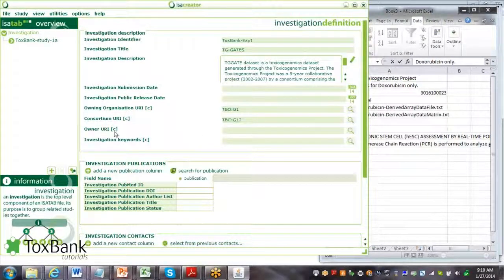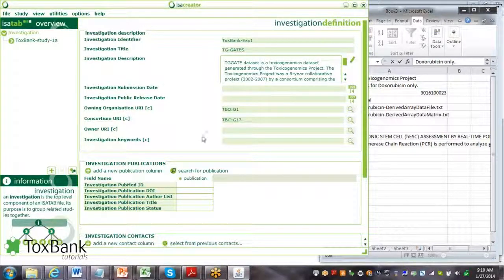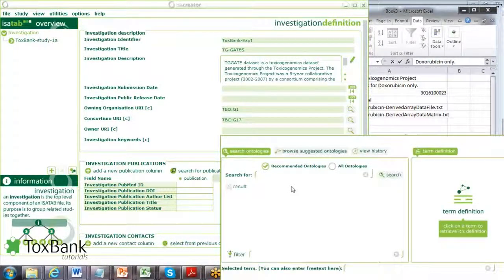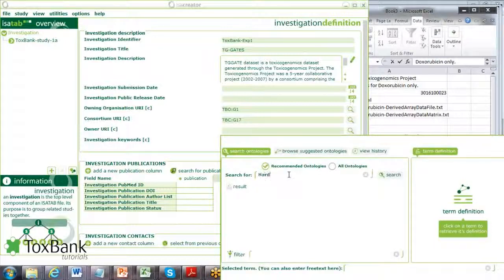Who owns it? Which individual owns it? For example, if Barry Hardy was to own this investigation, he's responsible for answering questions about the investigation.